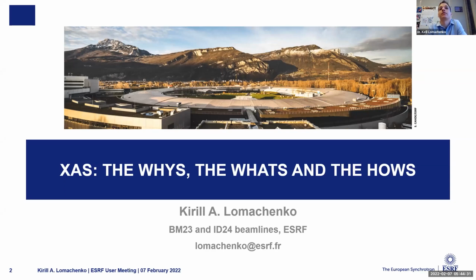But it is doable. And for this, you need to estimate the edge jump in XAFS mass, because like this, you can already get an idea about the data quality. If you see that, for example, your edge jump is 0.03, then you will already know that most probably you'll have to measure in fluorescence.